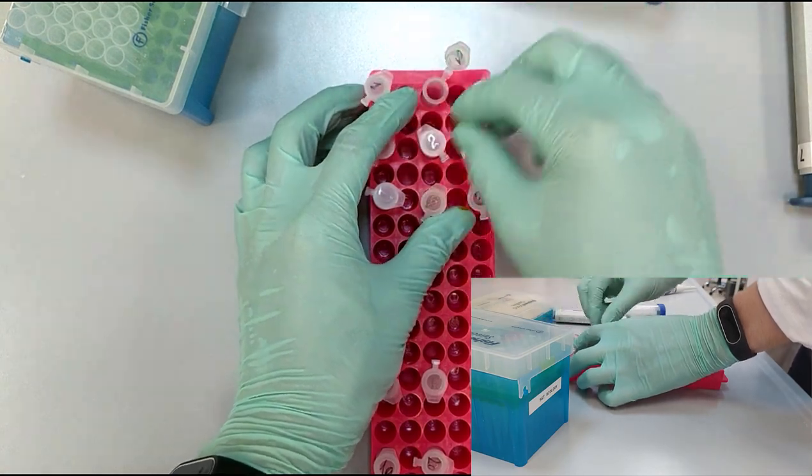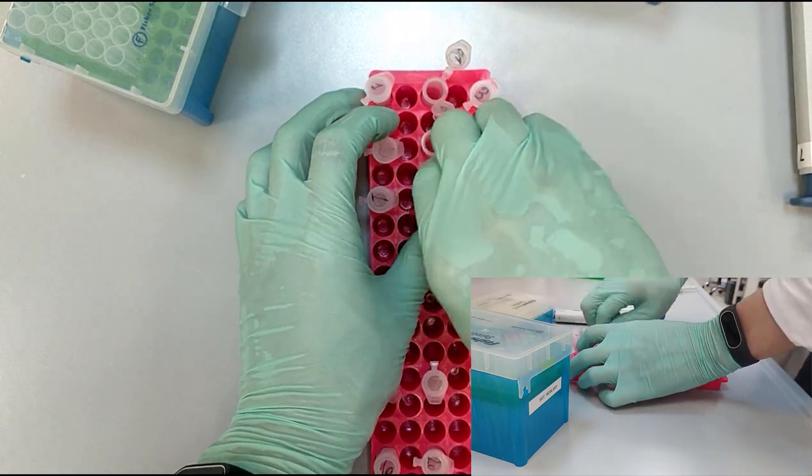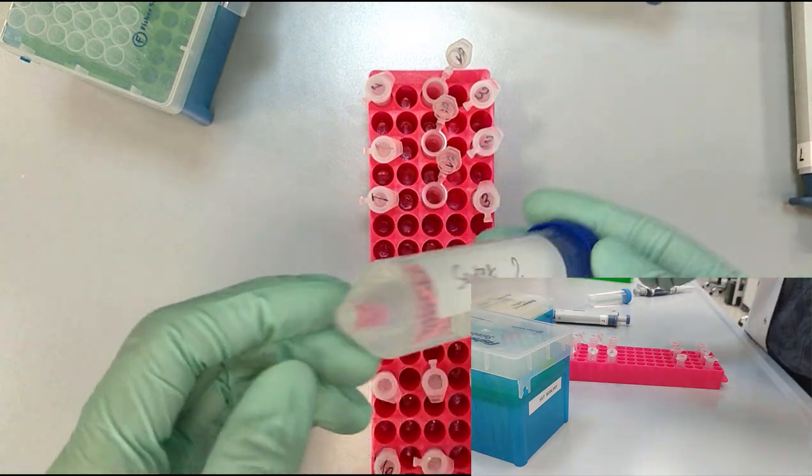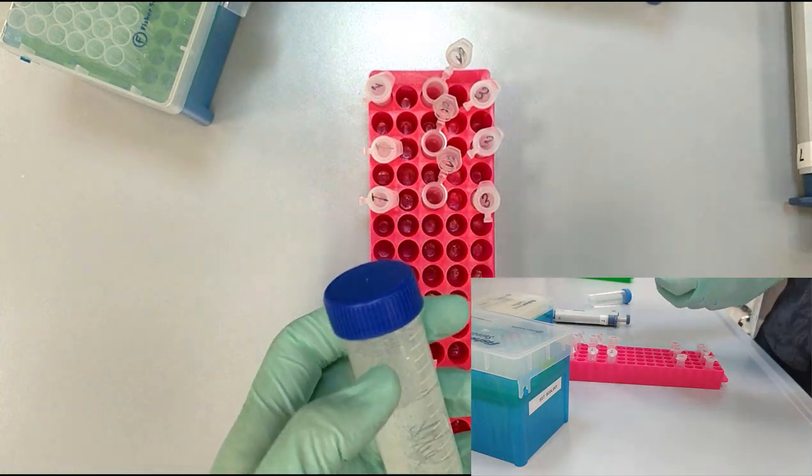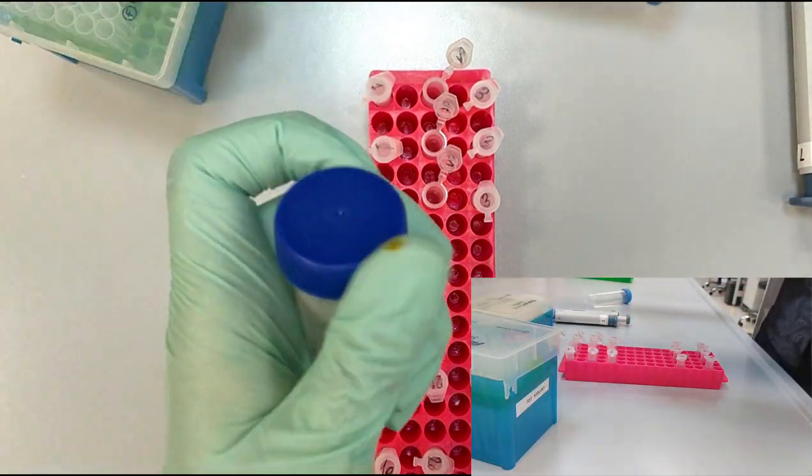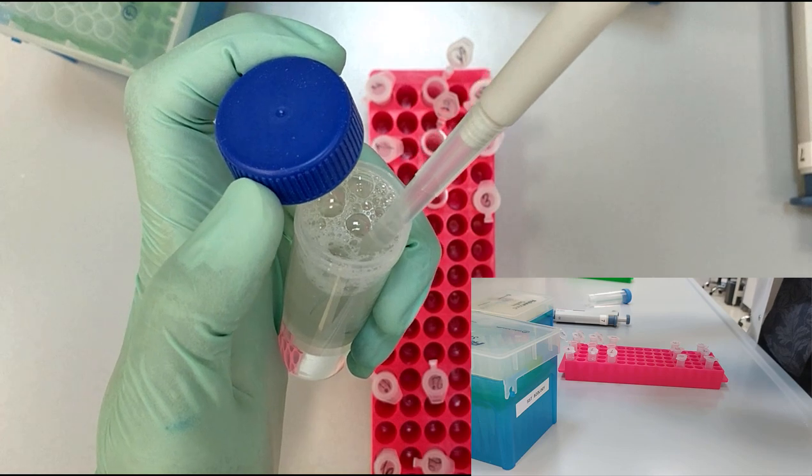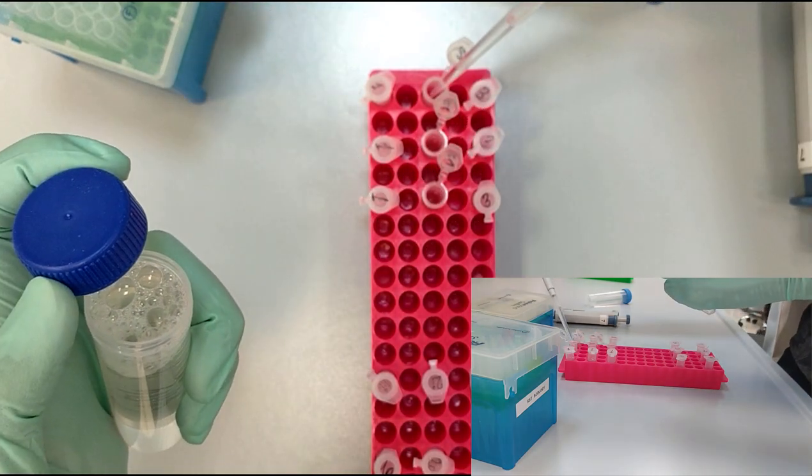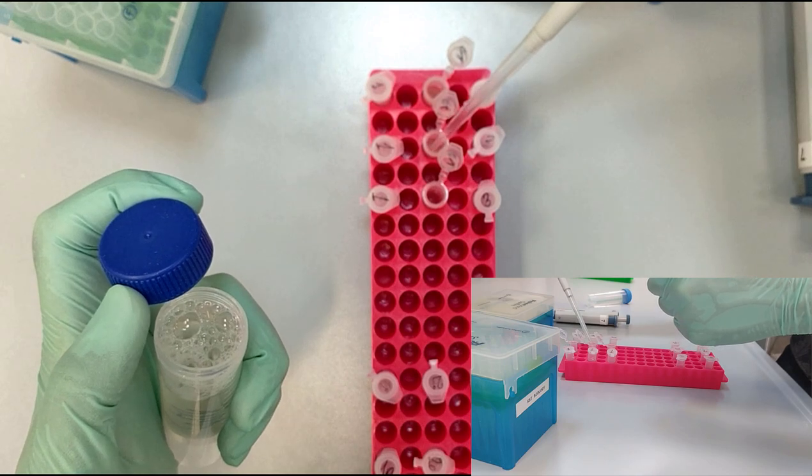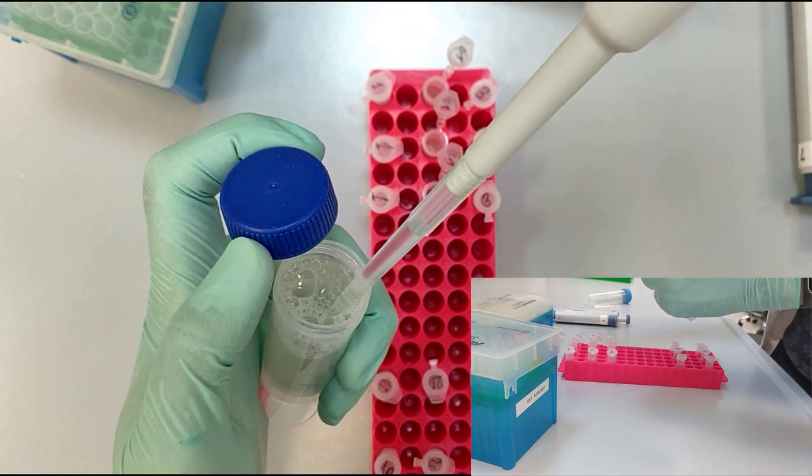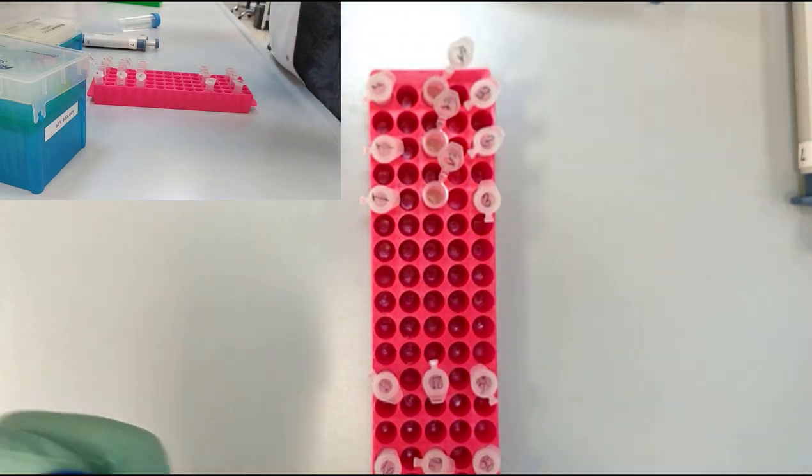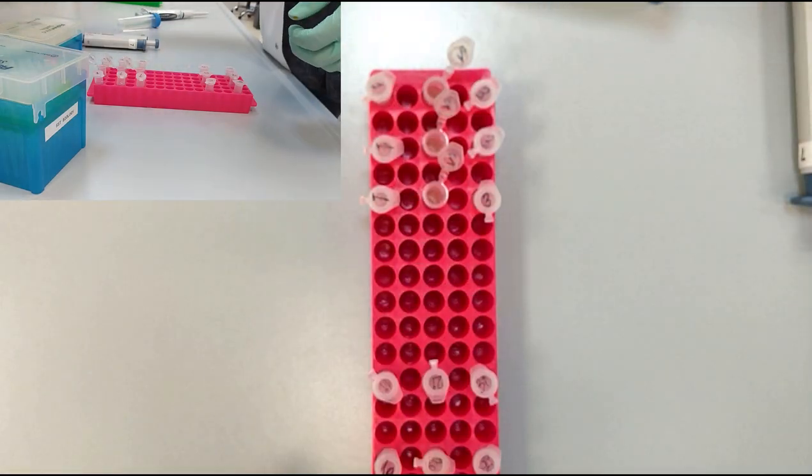Now we are going to open the second set. This is for secret solution 2. You also mix it, take the pipette, have your tip on, and then open the falcon tube. Now we have all of the eppendorf tubes with one milliliter of the second secret solution, and we close the lids.